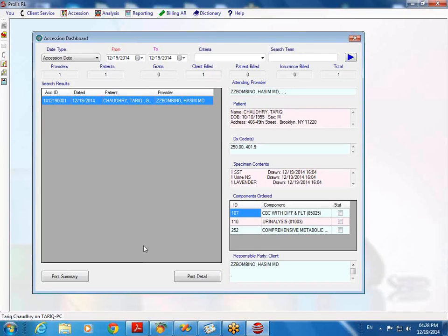So is this something that can be accessed remotely for others to see who might not necessarily be at the site? No, it is inside the laboratory. Any laboratory user can access it. But if you want to access the system from someone who is not present on the premises, there are other means which we can recommend, but those are not our products.